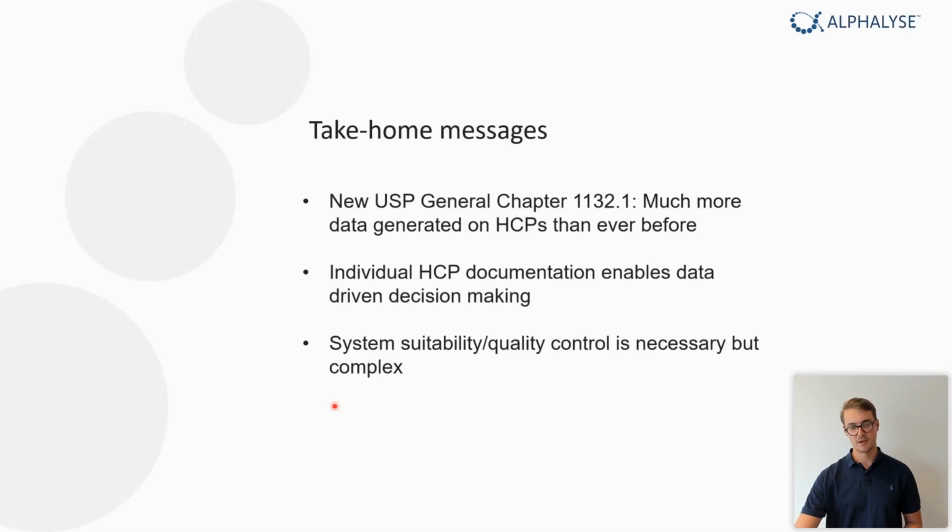It's important to have different system suitability and quality control steps in place to monitor your system and make sure that this analysis is performing correctly, because the quality of the data is very important if you want to use it in a database like this.